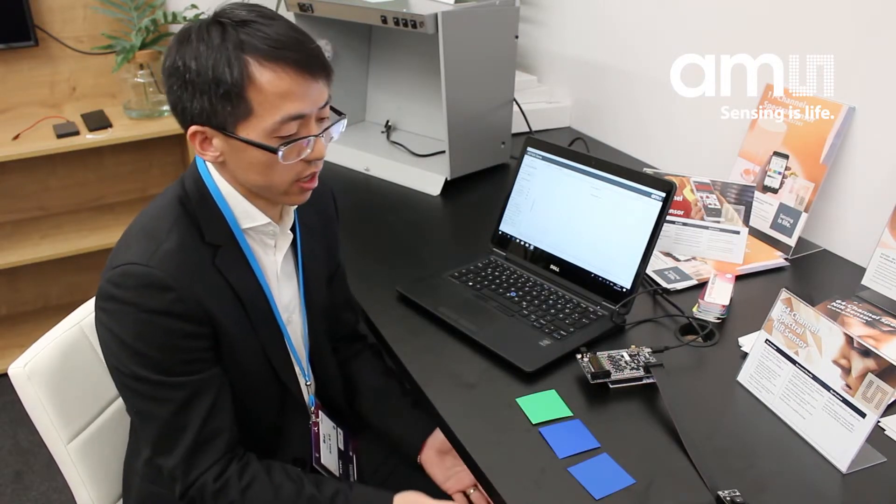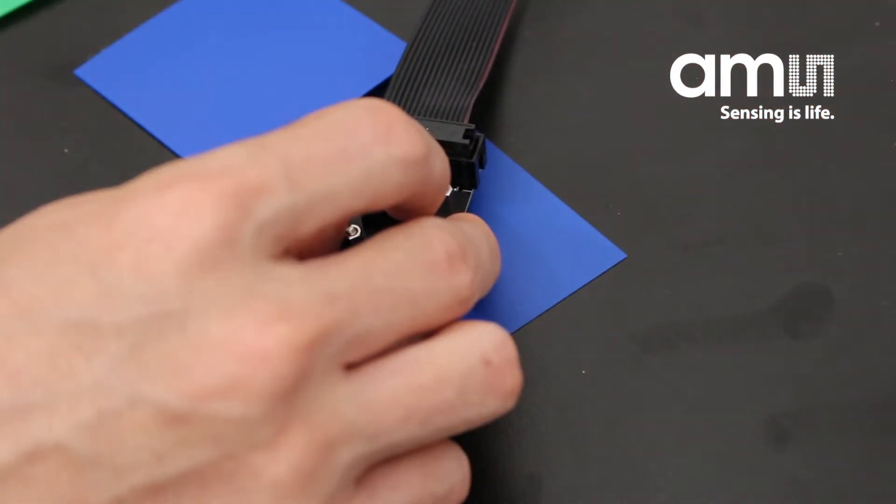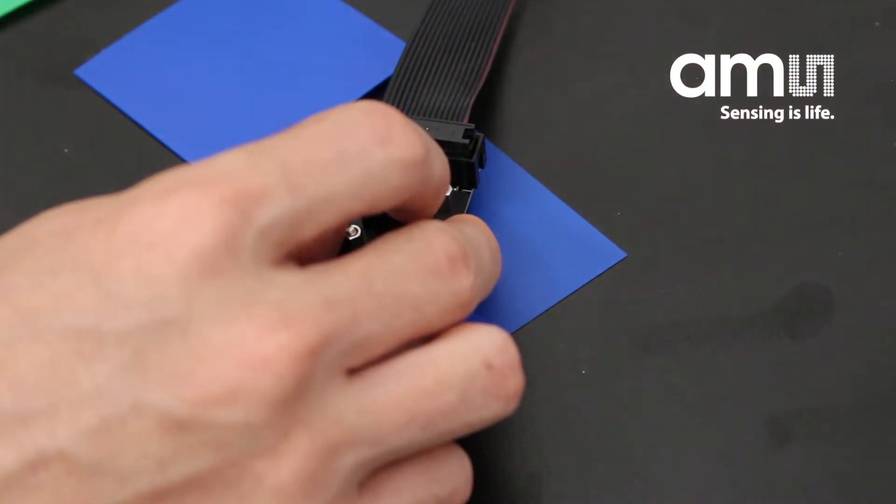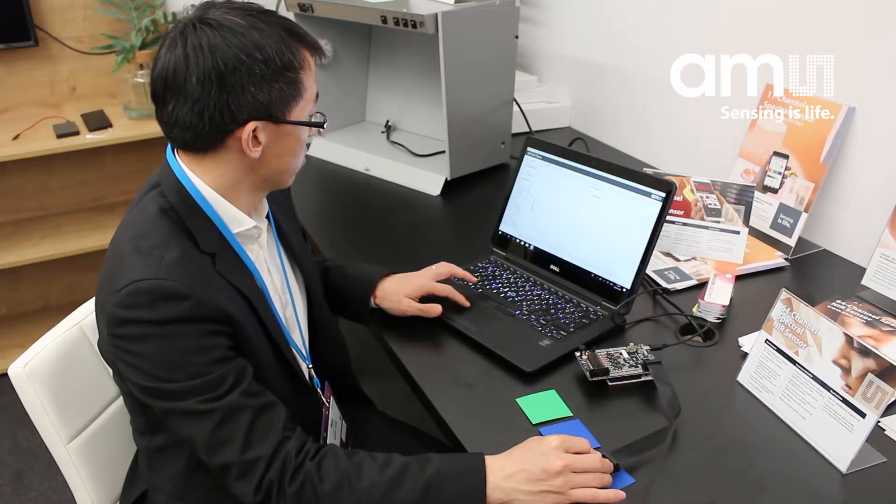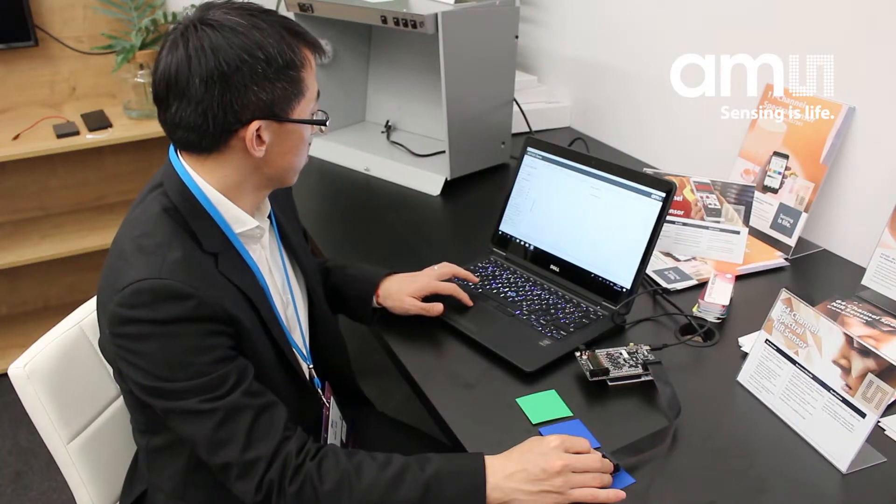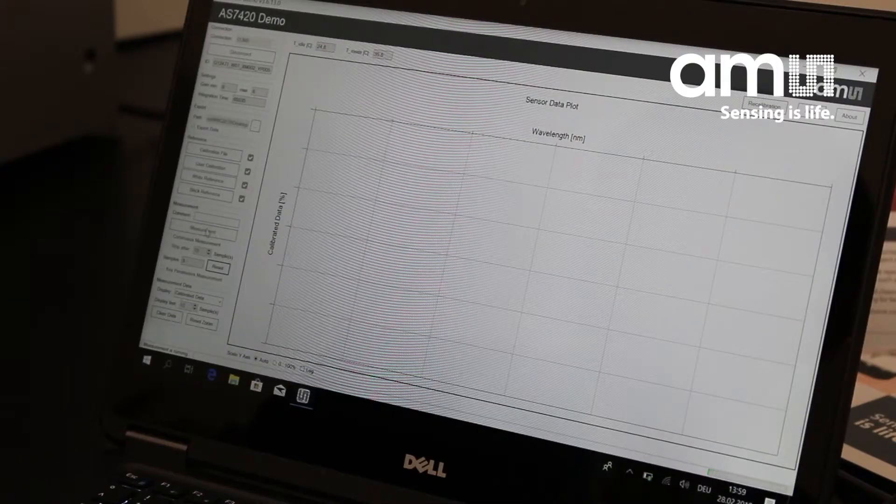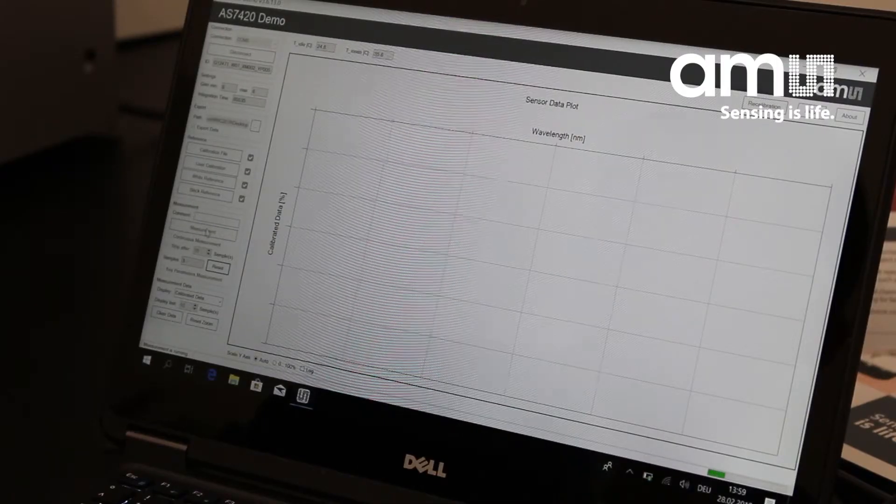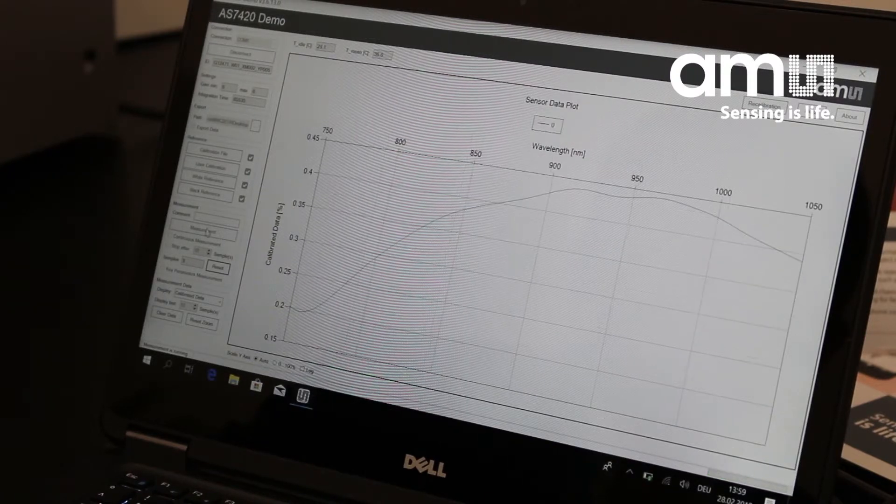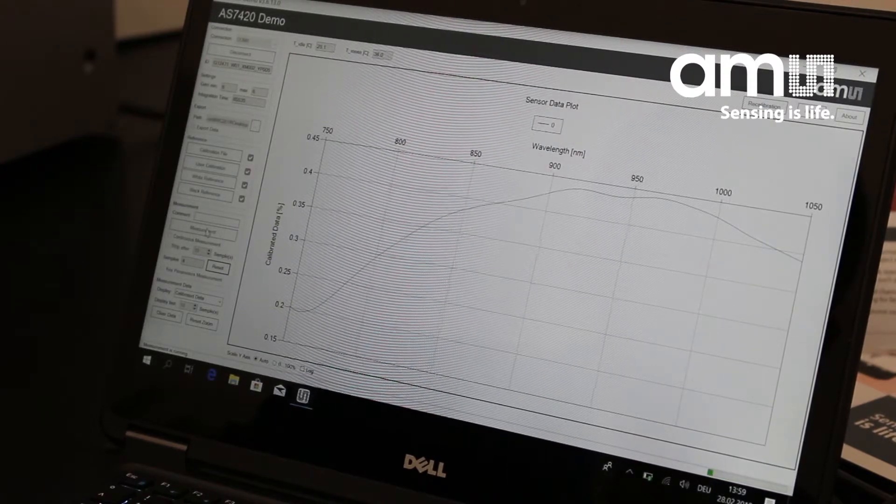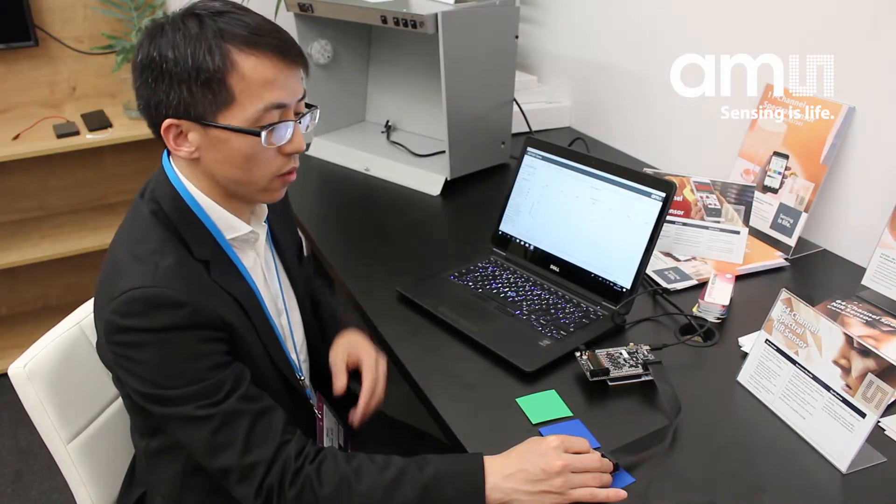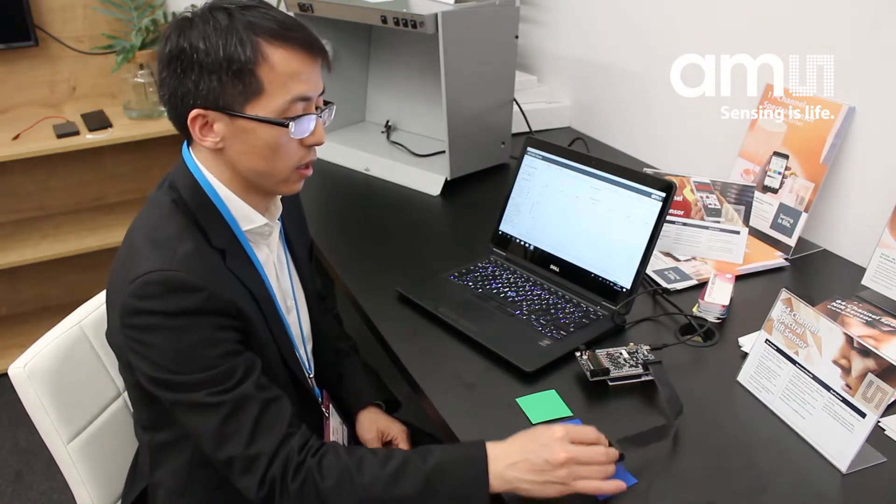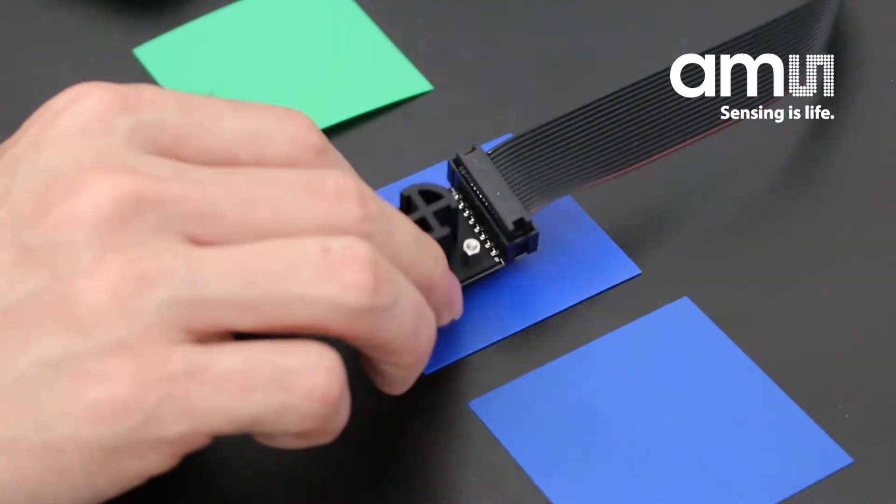So let's do this. First, let's measure the spectral of this soft one. Okay, you see that's the spectral of the first one, and then we do the second one.